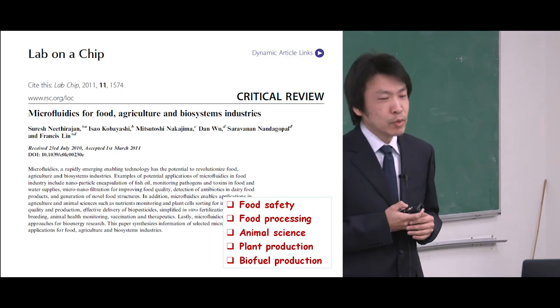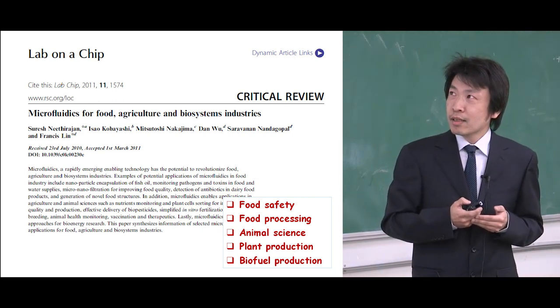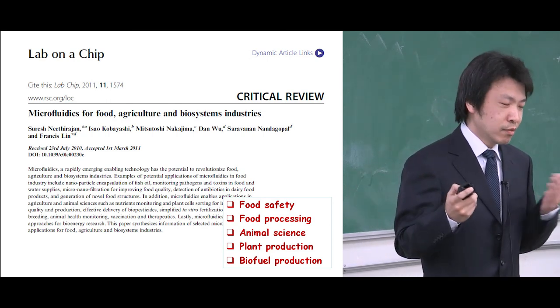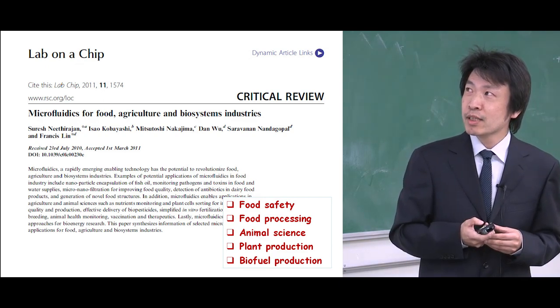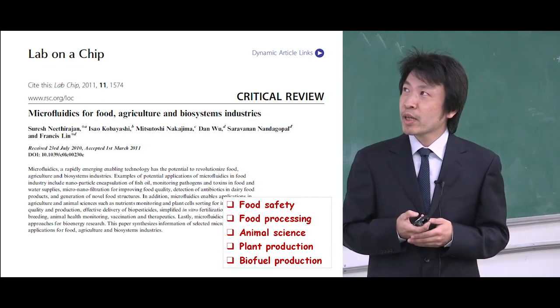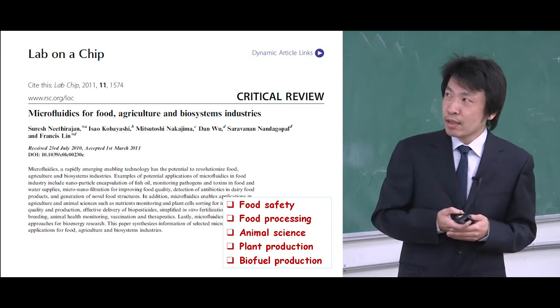So I want to mention we have been interested in applications of microfluidic devices in agriculture and biosystems from many years ago. We have a review paper published in 2011 in Lab on a Chip to look at the development at the time for the relevant applications in food, agriculture, and the biosystem industry.